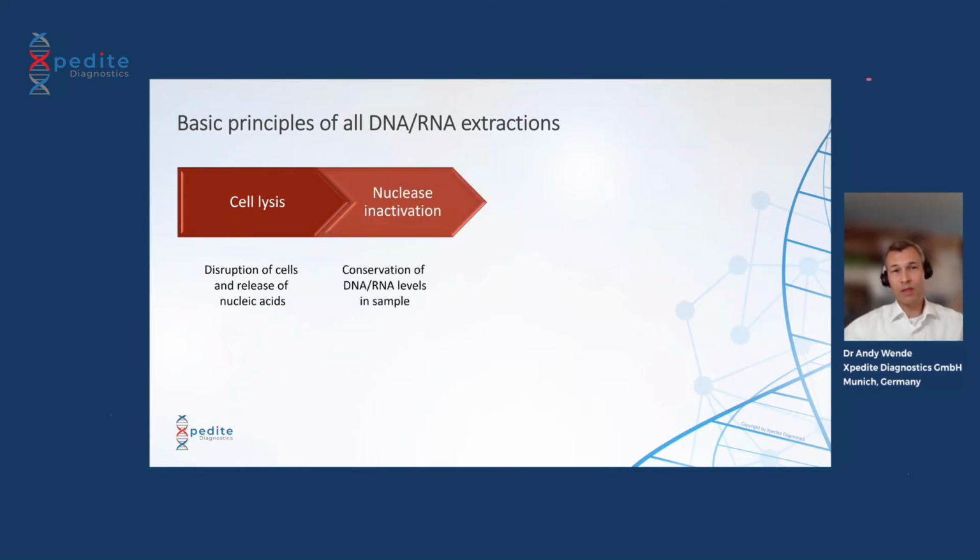And important while doing this is to inactivate nucleases, that means DNases or RNases, depending on what you want to extract. You have to make sure that these enzymes do not degrade your DNA or RNA in the sample while you are preparing the nucleic acids.